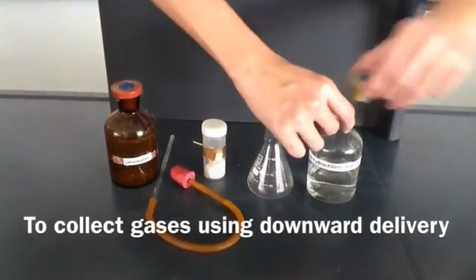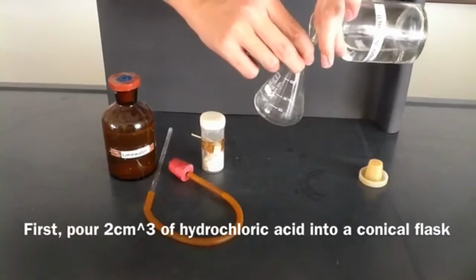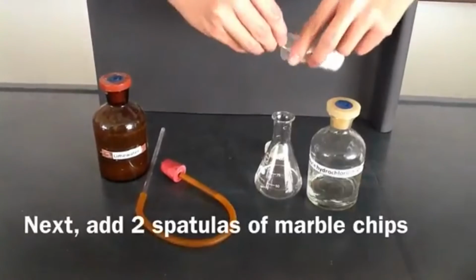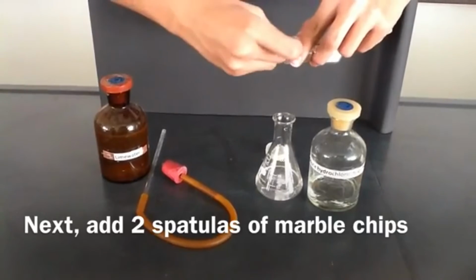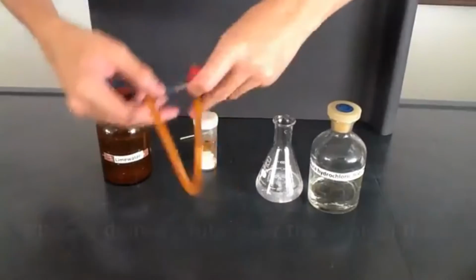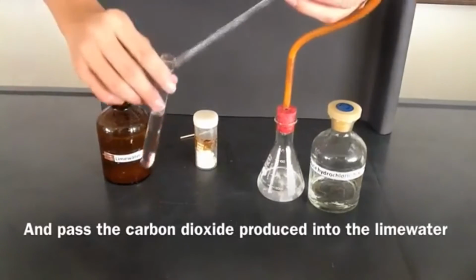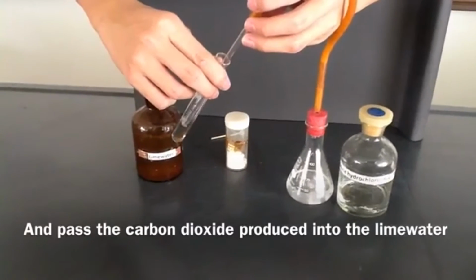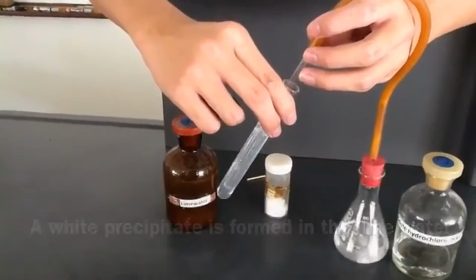To collect gases using downward delivery, first pour 2 cm³ of hydrochloric acid into the conical flask. Next, add 2 spatulas of marble chips. Place a delivery tube over the conical flask and pass the carbon dioxide produced into the lime water. A white precipitate is formed in the lime water.